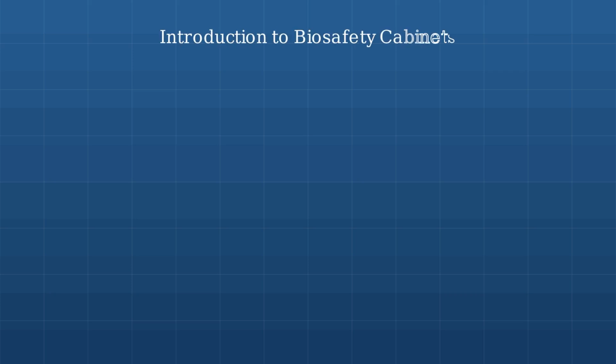Introduction to Biosafety Cabinets, Essential Protection in the Microbiology Laboratory.